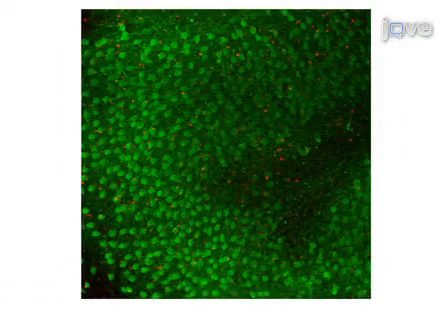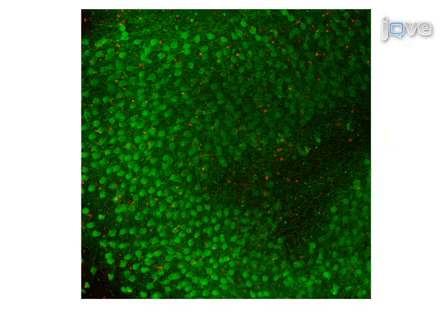The confocal image seen here is representative of a Fas-treated cerebellar slice. The Purkinje cells appear green after staining with a calbindin primary antibody followed by an Alexa 488 conjugated secondary antibody. The apoptotic cells positive for TUNEL staining appear red, as the TUNEL kit used is labelled with TMR red. Purkinje cells do not appear in a single row, but are clustered, forming a folium-like structure.